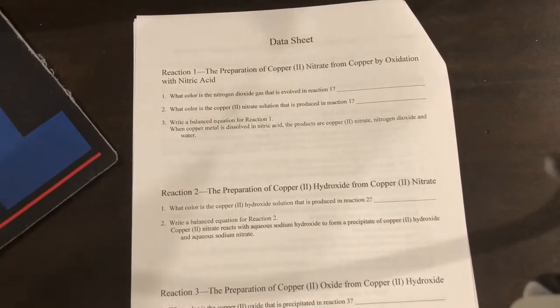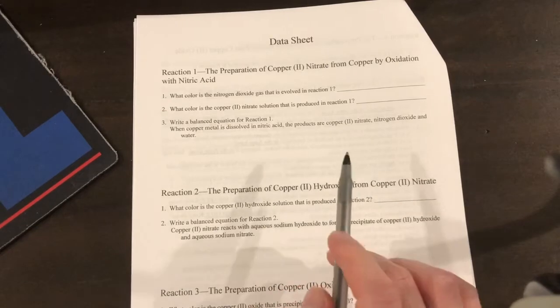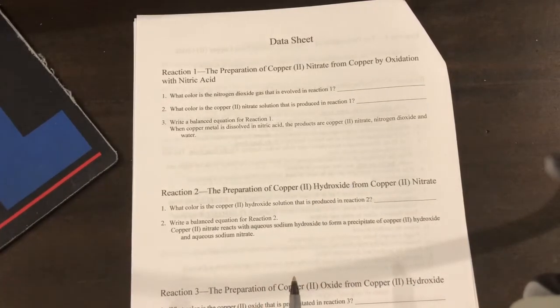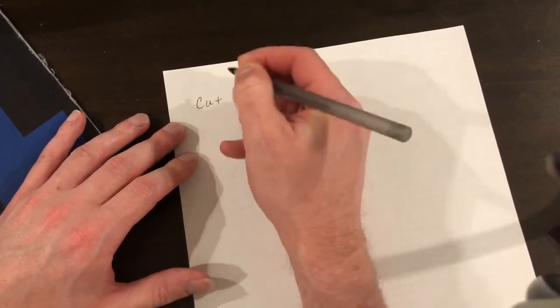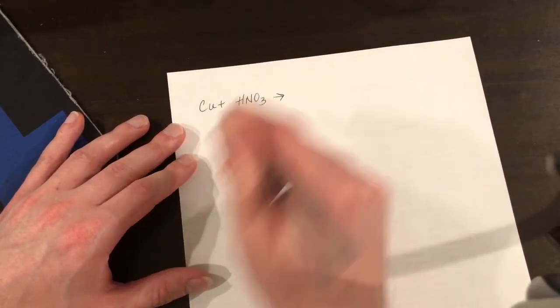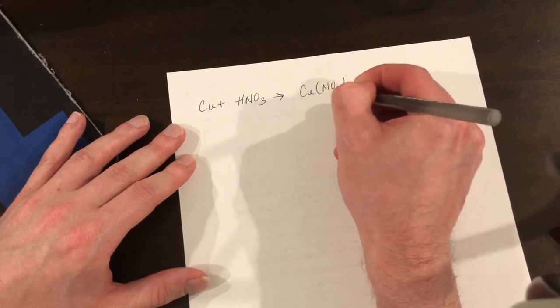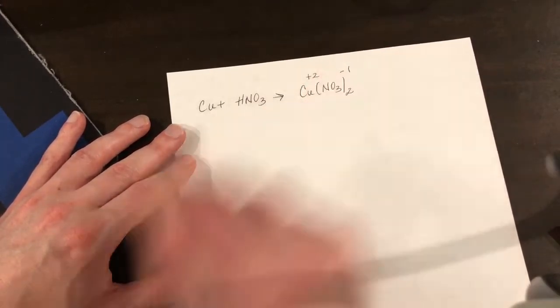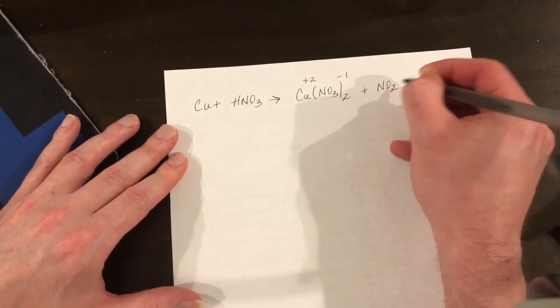Okay, so after every reaction that we record in the lab, we're going to go through the data sheet, especially the chemical reactions, because some of these are kind of difficult to balance, so we're going to go through that really quick. We got copper plus nitric acid, HNO3. And it says we're going to produce copper nitrate. We get that from our crisscross, like that. Plus NO2, that's the brown gas given off.